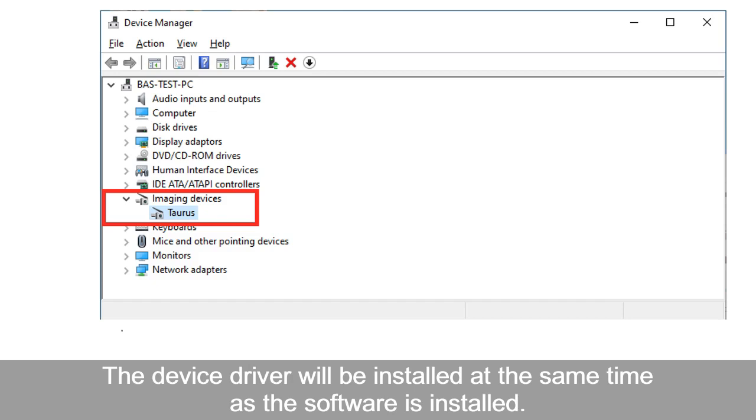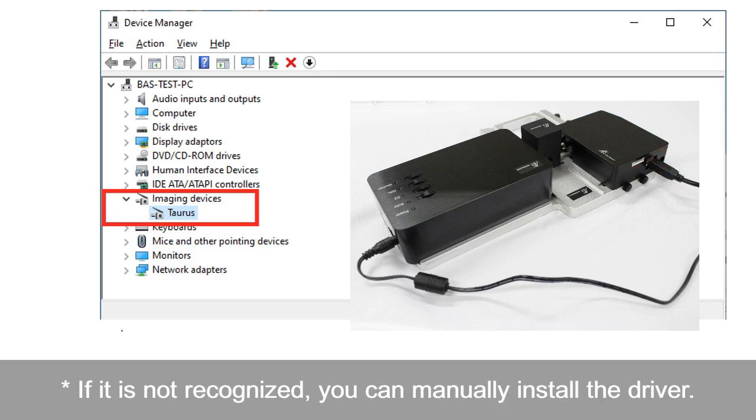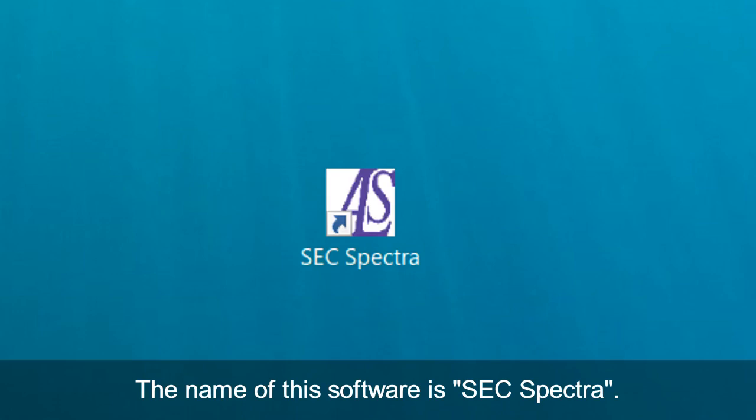After finishing the install, connect the spectrometer to your PC with the USB cable. The device is displayed as "Taurus" in the device manager. If it is not recognized, you can install the driver manually. The name of the software for the SEC 2020 spectrometer system is SEC Spectra.